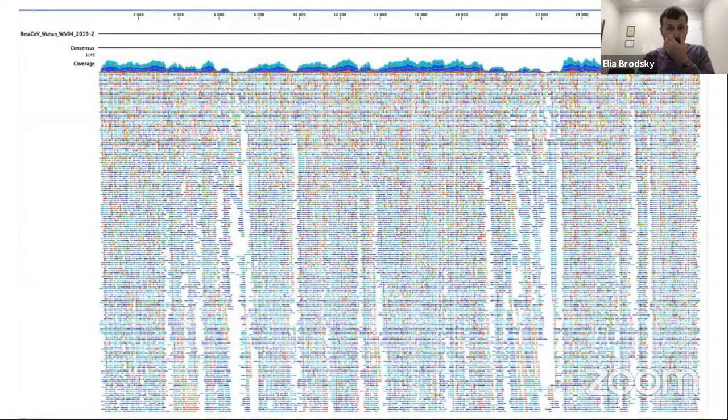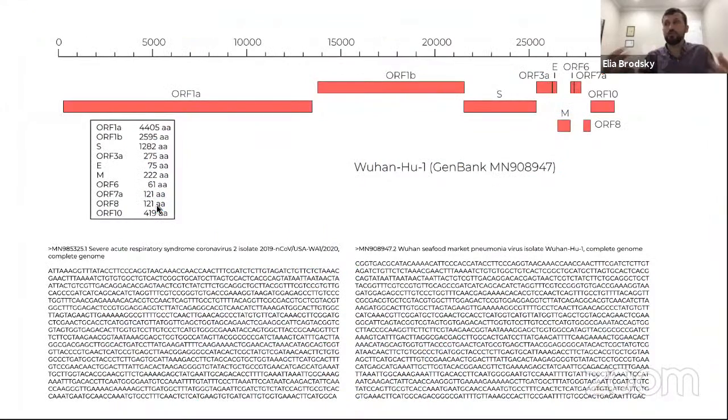As a result, we can get multiple types of assembled genomes, and these assembled genomes could have specific variations that help us characterize those haplotypes or completely new viruses, right? So in the case of this coronavirus, we can talk about these are samples from bats, these are samples from humans, these are samples from China, these are samples from USA.